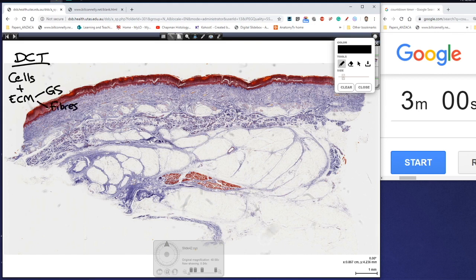Now in dense connective tissue in particular, we find that there are not many cells, and the cells that are present tend to be fibrocytes rather than fibroblasts. And we have very few transient cells.